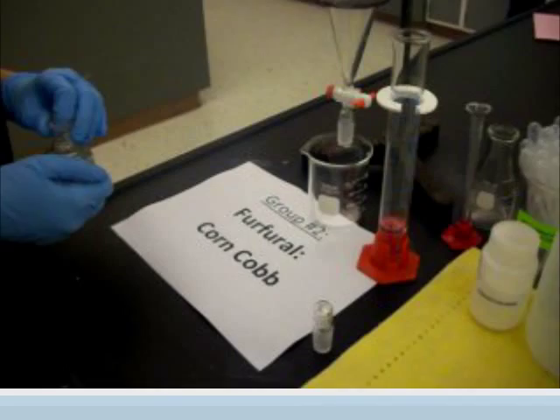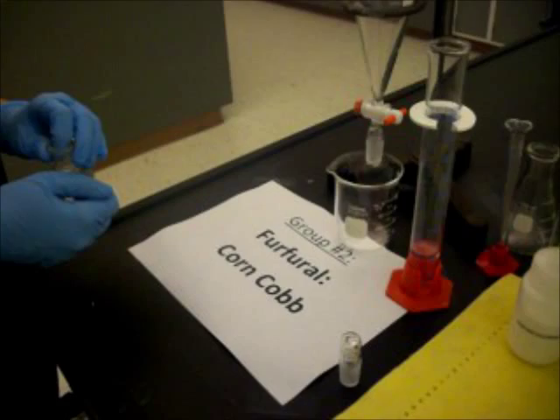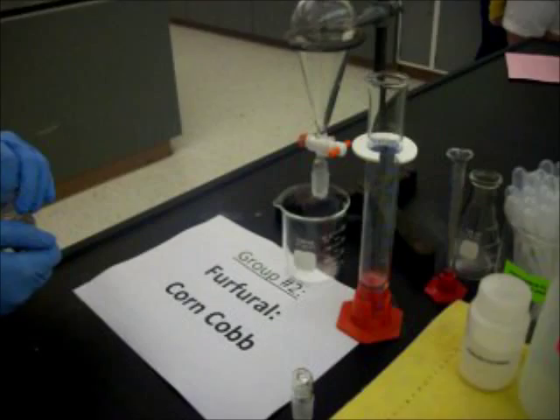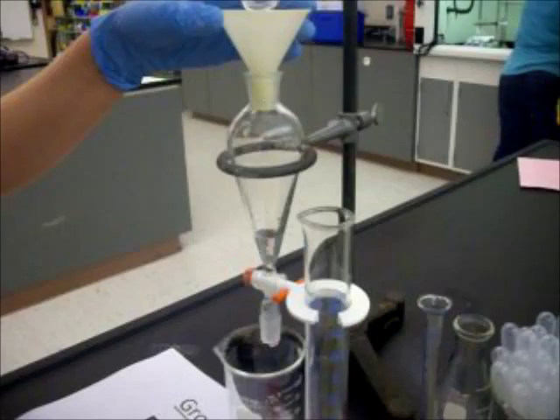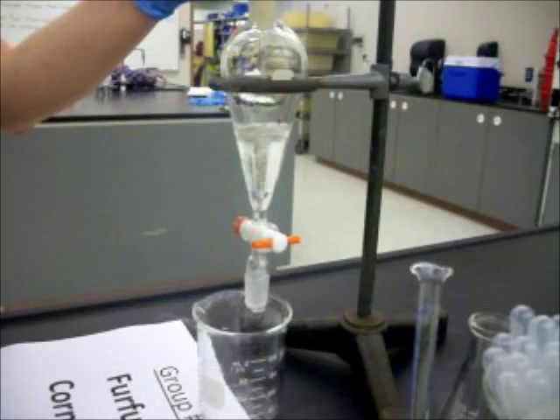Collect the distillate in a 50 ml round bottom flask. When approximately 10 ml of distillate has been collected, turn off the heat and transfer the distillate to a 150 ml separatory funnel. Add 25 ml of dichloromethane to the separatory funnel and mix well. Drain off the bottom organic layer into a 150 ml beaker. The top layer would be the waste.